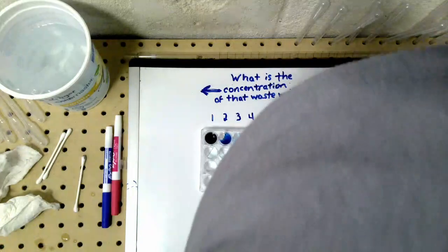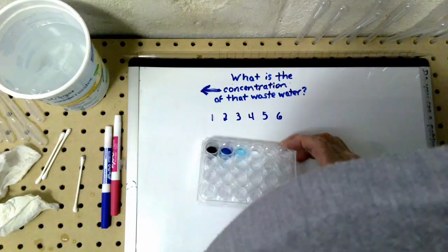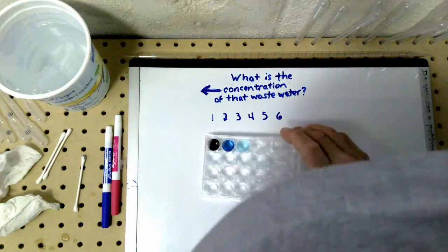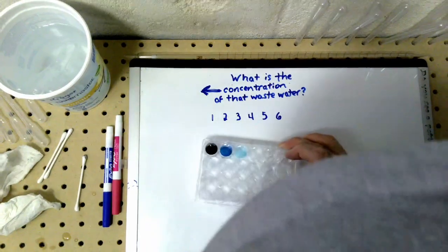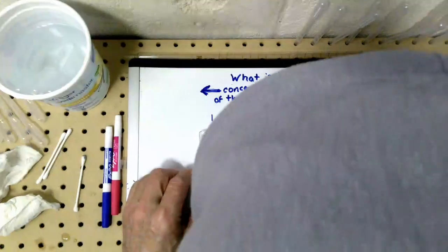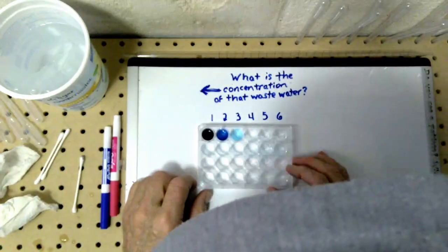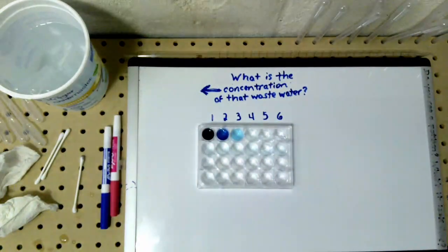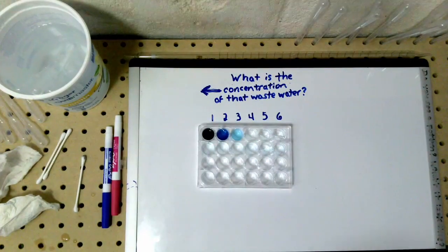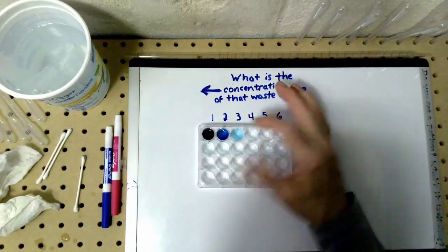And I'm going to kind of stir it up, get it so all of these are kind of on the bottom there somehow. A little bit of adhesion, cohesion, lots of cohesion there. Is that the right word? I think I got it. But anyway, it's really hard. I think it's a little darker. I think this is obviously darker.